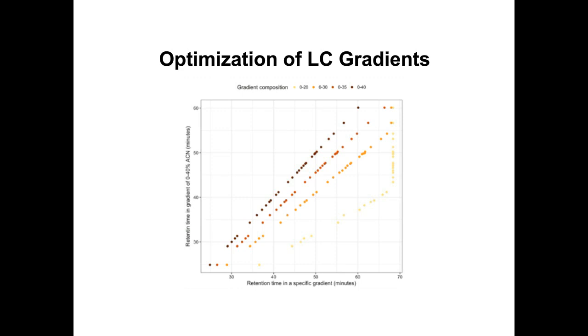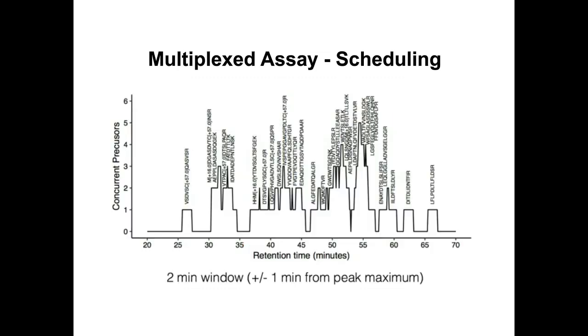And here you can see on the x-axis the elution time, and on the y-axis how many concurrent PRM events we're following at that given time. So if you compare this back to our initial stage, where we had 450 and sometimes had to follow 60 targets at a given time, this is now dramatically less. So a max of 5 peptides at a given time had to be followed. That gives us much more time that we can sit on these peptides.